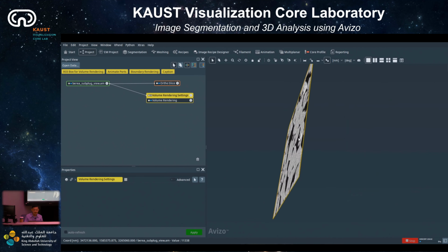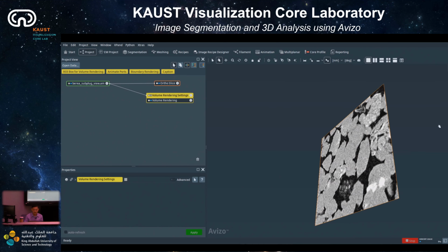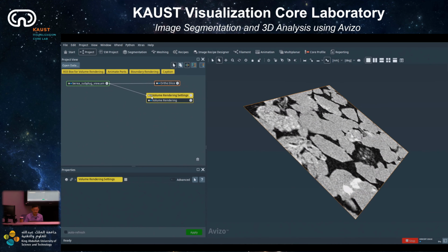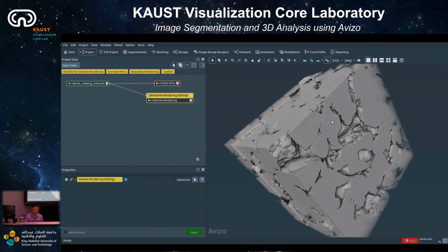It's really useful because later, if you would like to do some image registration, you have 2 images, 2 volumes, and you would like to bring them together. So you might need to switch between rotating them, for example in the volume rendering, and later use this interact tool to move them around.